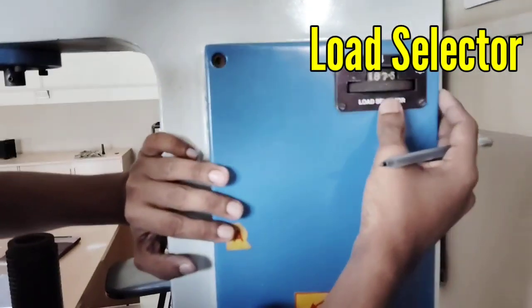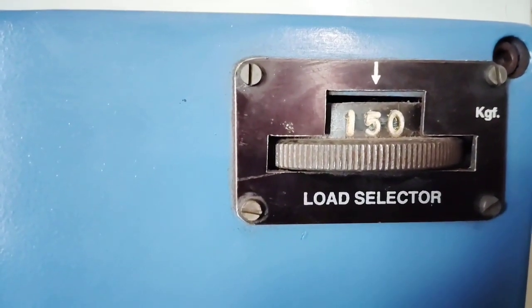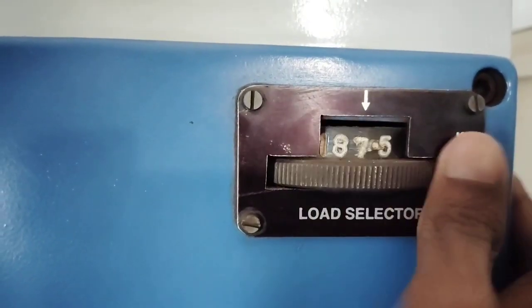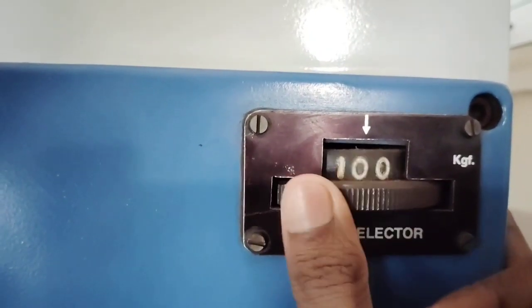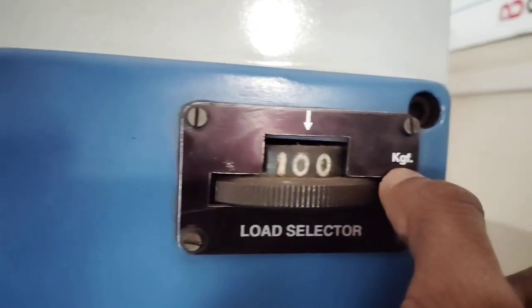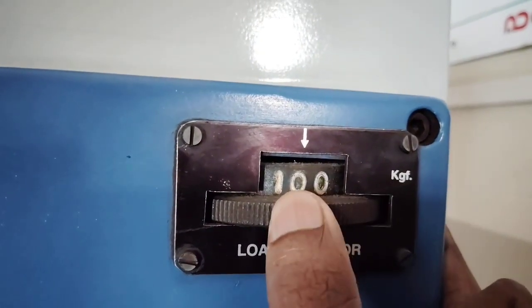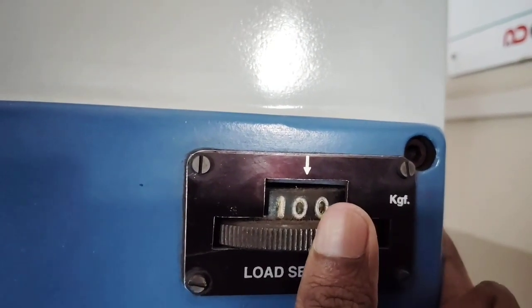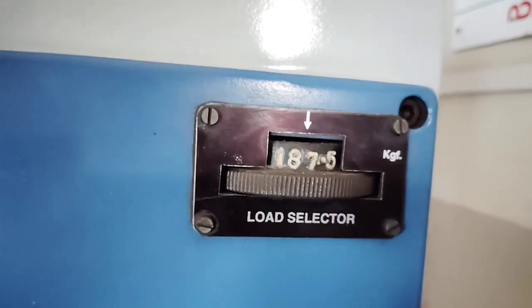This load applying part has a load selector. The amount of load we want to apply to our specimen, depending upon the Rockwell hardness scale, is given over here. It starts with 60 and 100 kgf, which will later be converted into Newton. Then 100, 150, and the maximum we can apply is 187.5. So this is the load selector.